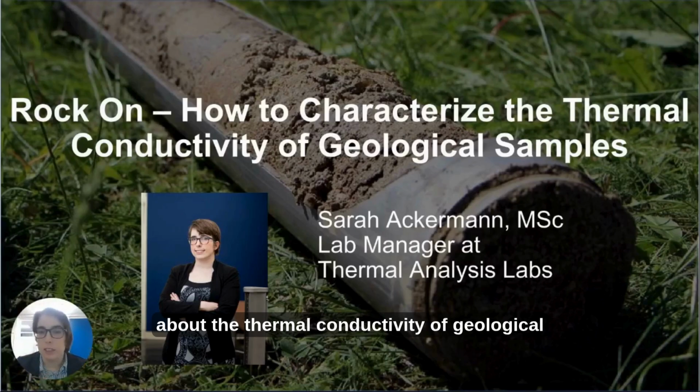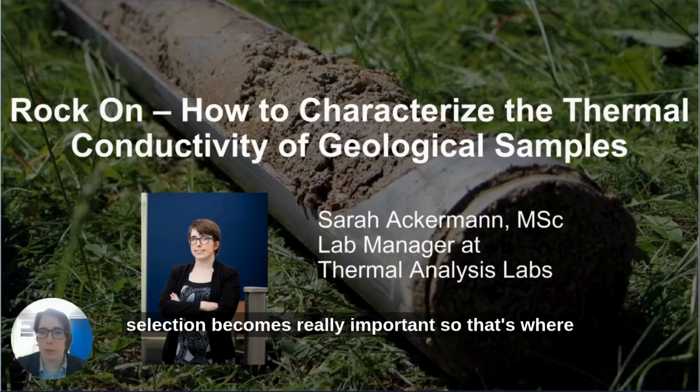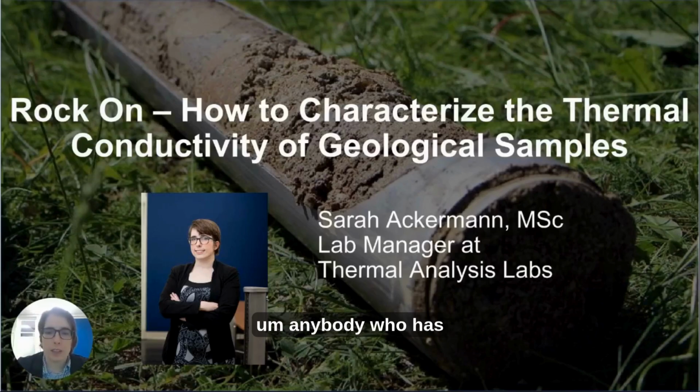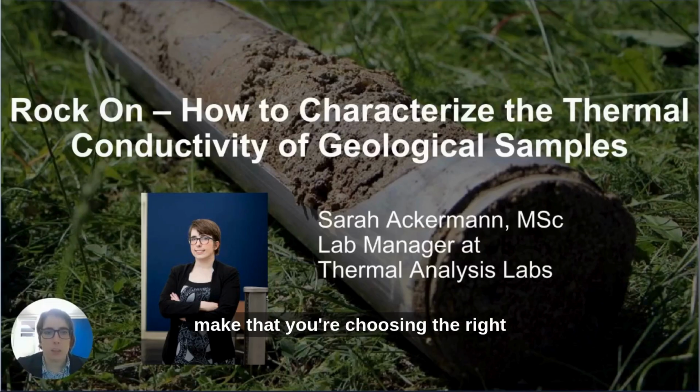Okay, so talking about the thermal conductivity of geological samples, it encompasses a very wide range of material phases, degree of purity, and other factors. So it's a very complex field, and therefore method selection becomes really important. So that's where anybody who has any interest in geological materials, we would very strongly recommend you to take a look at the method selection guide. Make sure that you're choosing the right material test method for your samples.